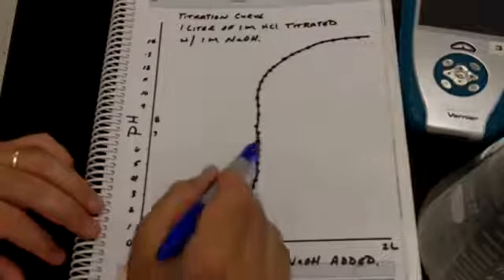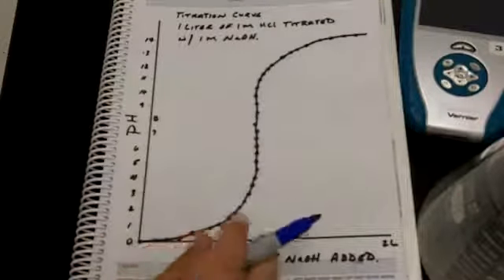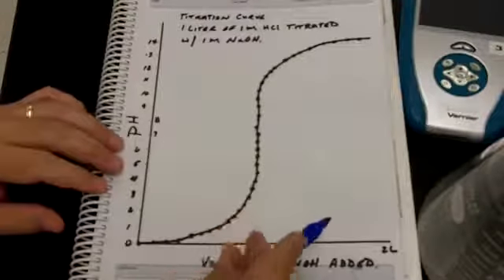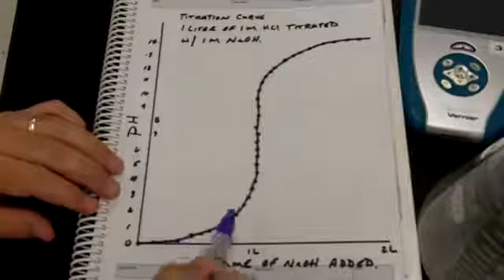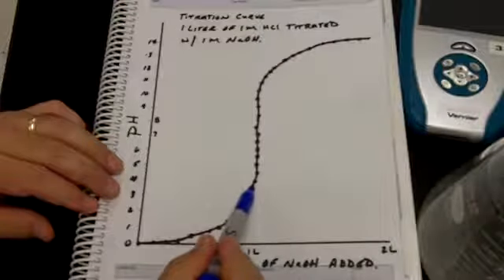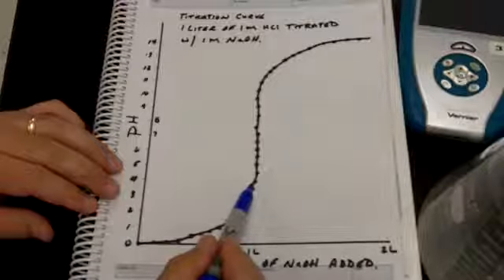So in this portion of the graph, the hydrogen ion concentration is decreasing very, very quickly. Now, as I approach this part of the graph, the number of hydrogen ions is decreasing because hydroxide is sopping them up, forming water in the reaction that I just showed you.